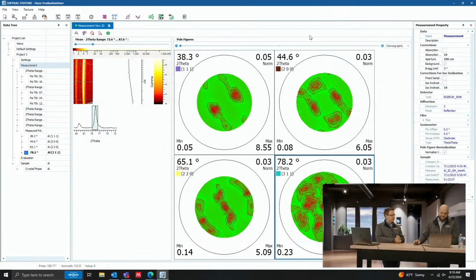Exactly. Okay. So now on the pictures, I see we have these numbers. You're talking about the reflections? Yes. Those are the crystal reflections, and that's something called Miller indices. If anybody wants to know about it, there's a lot of great content out there. I don't think we've done one yet on it, but for example, 111 would mean it's the diagonal plane. Exactly. And then 200 is along a face, but because it's a 2, that means it's half of the unit. Same direction. Yeah, exactly. So those basically designate what orientation we're looking at in the unit.